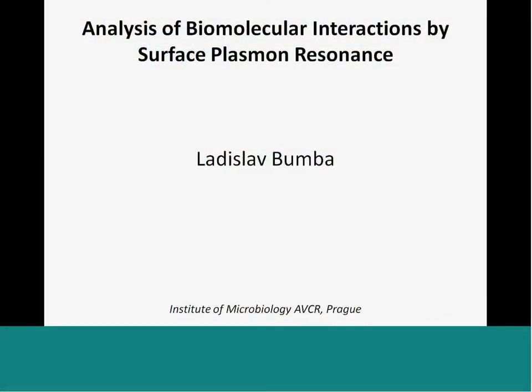Okay, thank you for your introduction. And I will present my recent data. As you mentioned, the ProteOn XPR36 machine was bought by our institute 2 years ago, and I'm the person who is responsible for managing this instrument and for measurement.